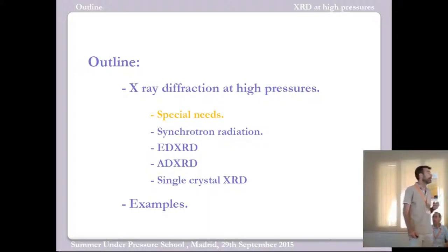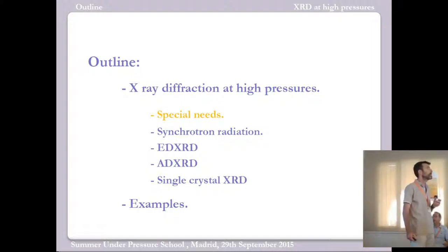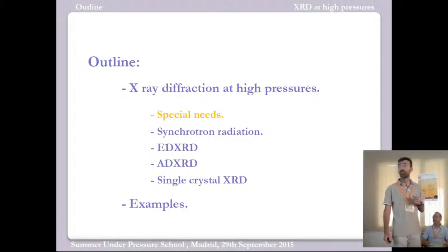First of all, I will deal with the particularities of X-ray diffraction at high pressure, and we are going to see why synchrotron radiation is so important. I will dedicate some time to synchrotron radiation. Synchrotron radiation also allows you different approaches to X-ray diffraction, including not only angle dispersive X-ray diffraction, but also energy dispersive X-ray diffraction. I will also speak a little bit about single crystal X-ray diffraction.